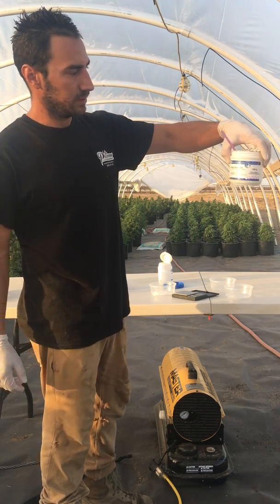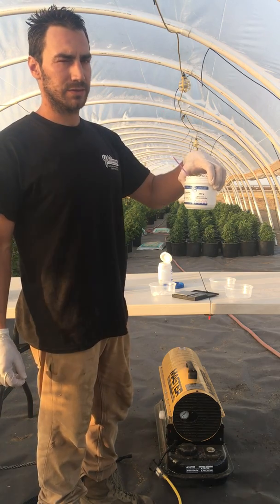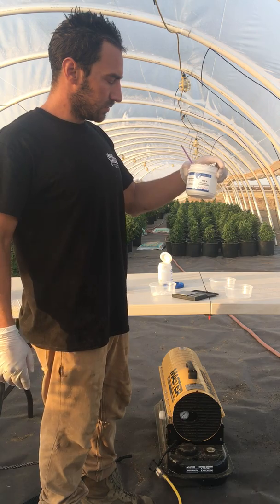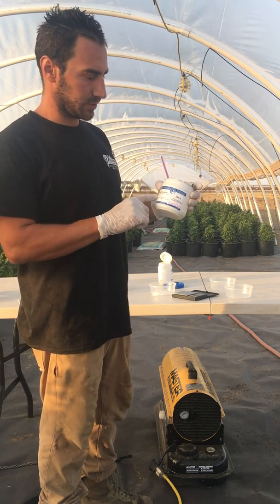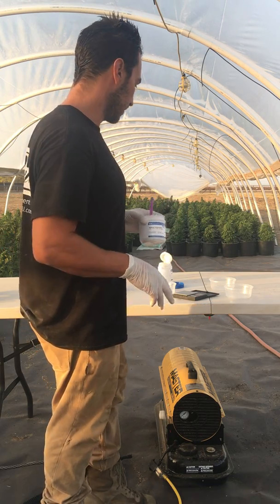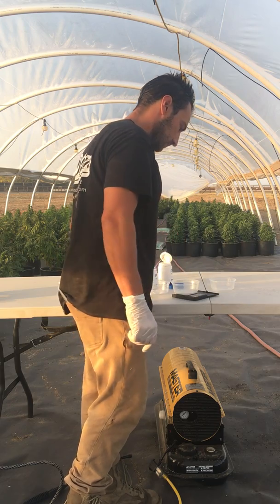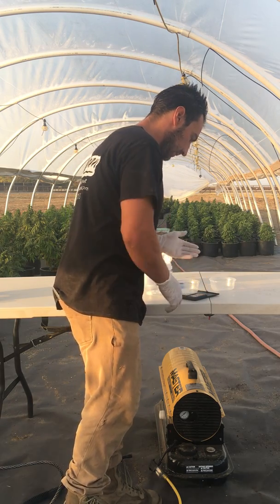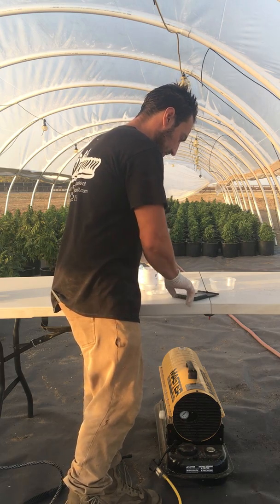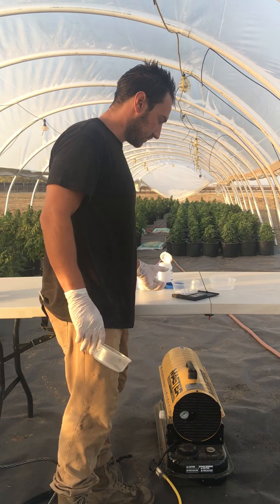The first step is I'm going to take my sodium thiosulfate. I'm going to make 1,000 milliliters of this solution and put five grams of sodium thiosulfate into 1,000 milliliters of water and mix that really well. Right here I've got a little digital scale and I just went ahead and put five grams of sodium thiosulfate in here.